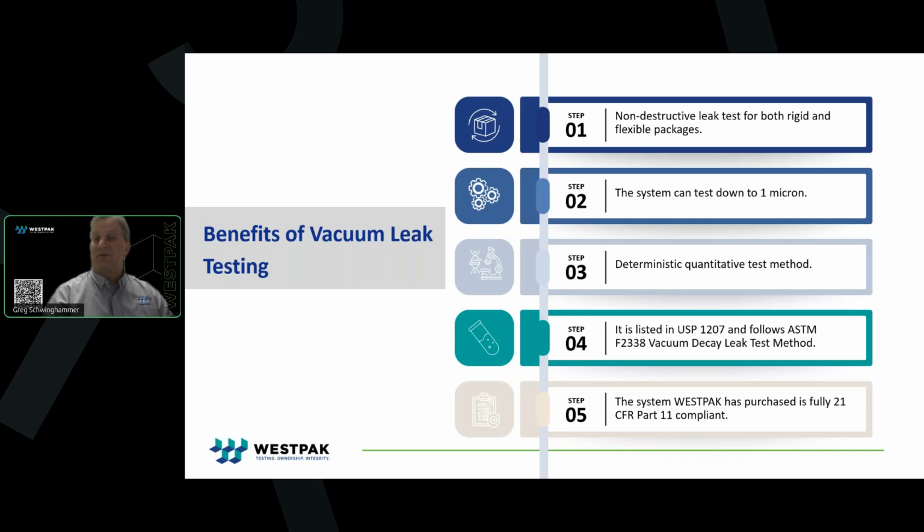Overall, this test is useful as a research tool for optimizing packaging, sealing parameters, and for comparative evaluation of various packaging and materials. This test method is also applicable to production settings as it is a rapid, non-invasive, non-destructive test, making it useful for either 100% inline testing or for testing a statistical sample for production operations. And we've seen this when we've been on some customer tours, that they have these systems in place for 100% evaluation of their product as it goes down the manufacturing line.